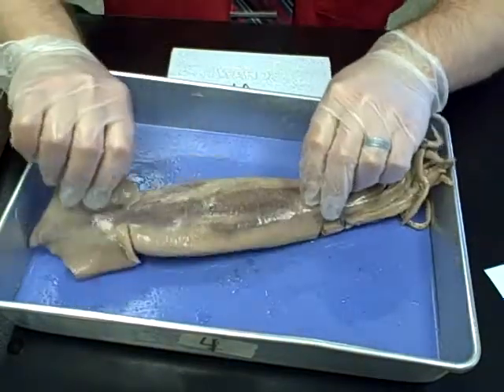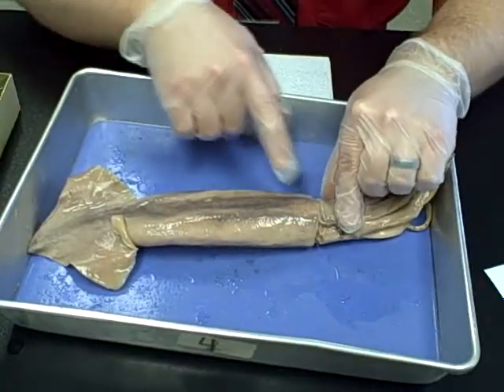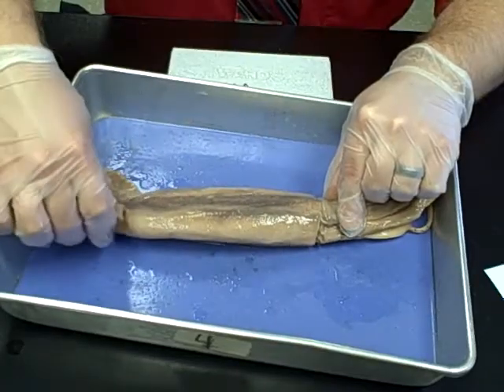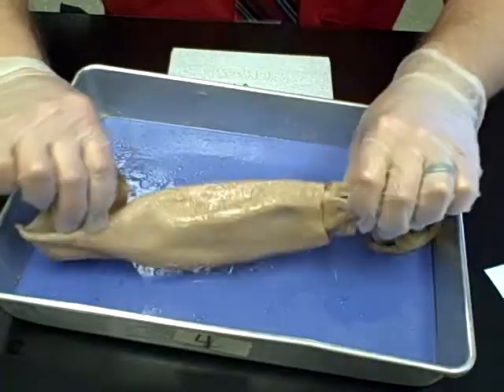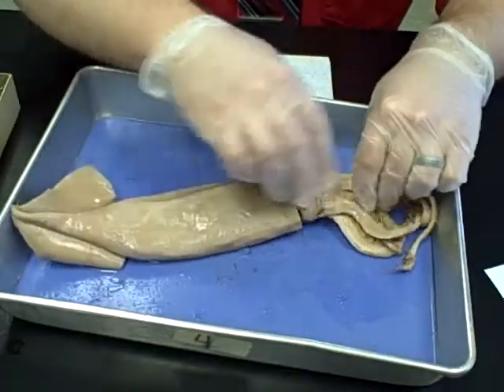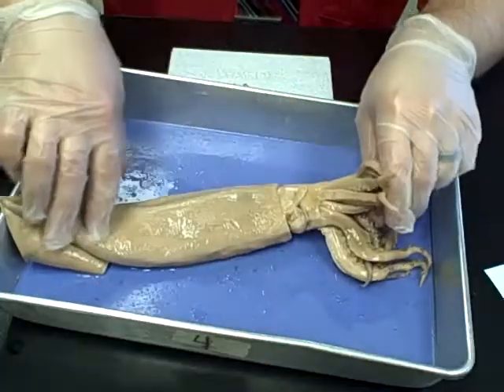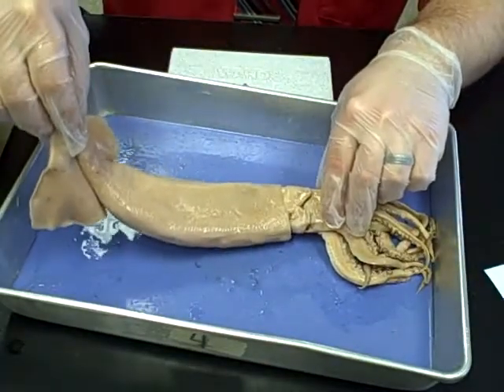If we flip it over to the dorsal side, the siphon is gone, and you can see the mantle doesn't extend all the way up to the top — it's blocked by the fins in the upper portion of the squid's anatomy. Flipping back over: this is the anterior side where all of the tentacles are, and on the back we have the posterior side, where the fins are.